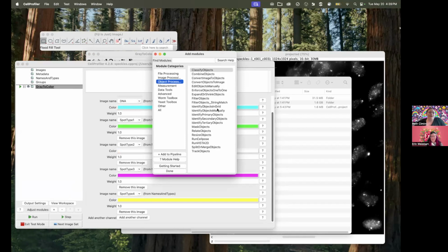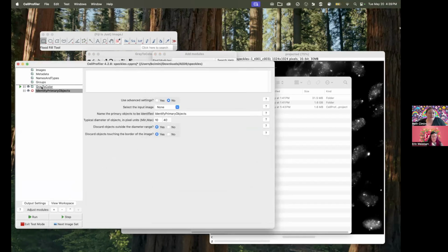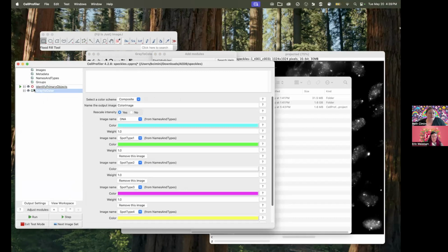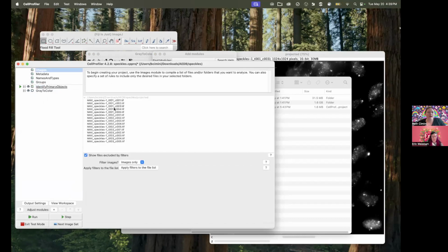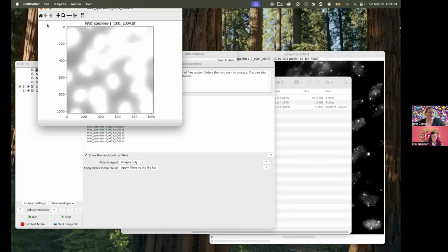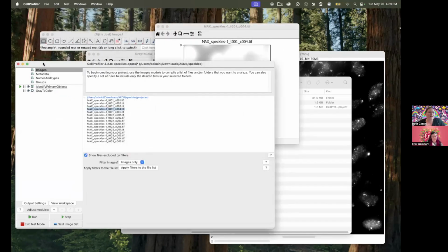I'm going to make some quick nuclei and cells here. I'm going to drag this down and turn it off for now because we don't need it. We probably don't need these, but it's nice to have them. How big are my nuclei? I should also change my visualization settings, which is a helpful thing to do.